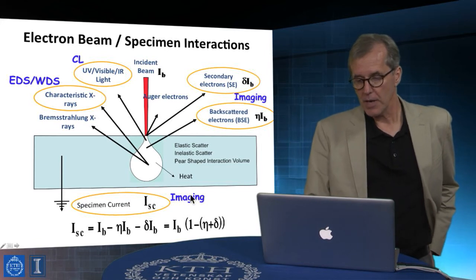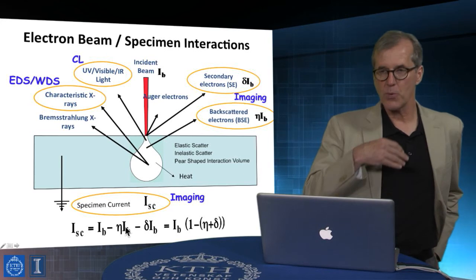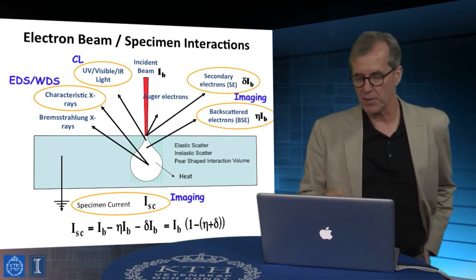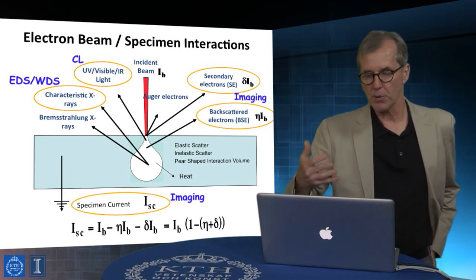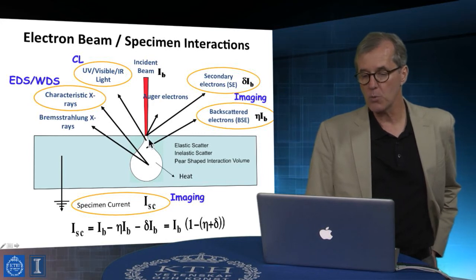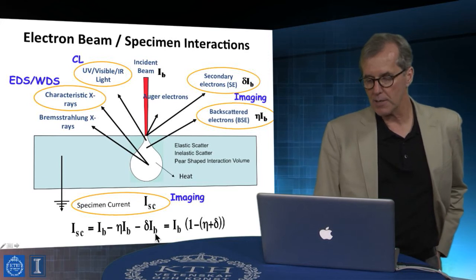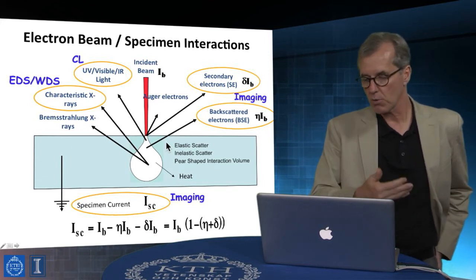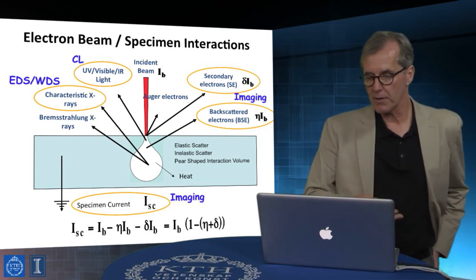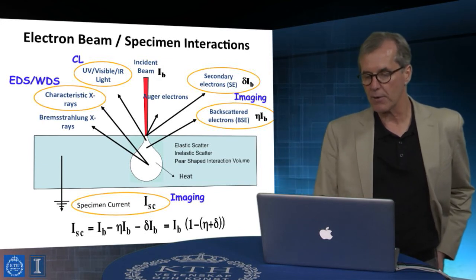Okay, and if we sum all this up, basically there's got to be detailed balance: we can't have more outcome than the number of electrons put in. So fundamentally, the detectable currents that come from any form of matter have a lot to do with the flux of electrons on the incident surface. And materials tend to partition these excitations across a broad variety of de-excitation or inelastic scattering events.